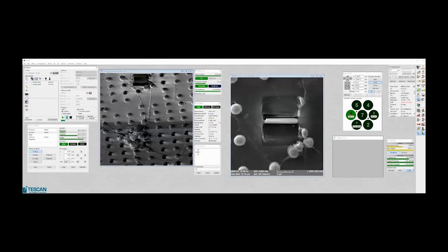Okay, I probably put it too far because we can see the line here. I'm not cutting the lamella, but I cut the substrate, so I will put it here. So one more time.